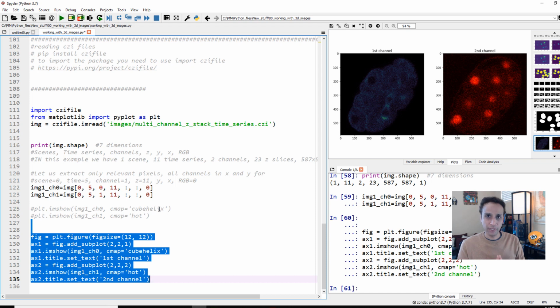Now, there are 3D operations that you can actually do. I believe the non-local means filter, for example, you can do in 3D, but it takes forever if you have a normal, poor man's computer. Unfortunately, very few libraries can actually handle 3D in its native 3D state, like applying a 3D kernel and not just 2D slice by slice. So one day I'll find time to make a video after identifying some of the useful 3D libraries.